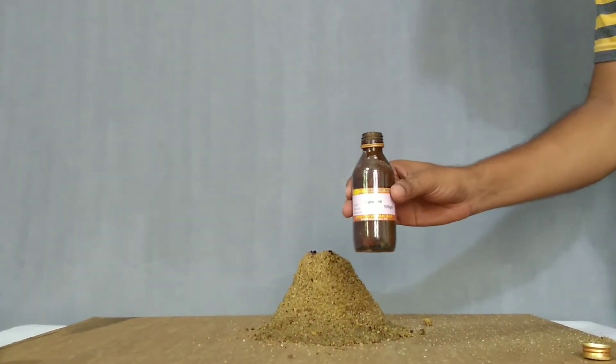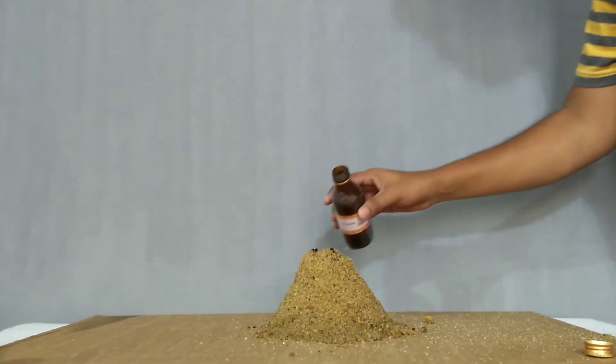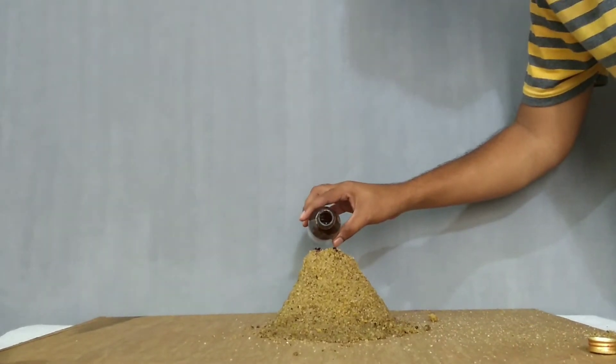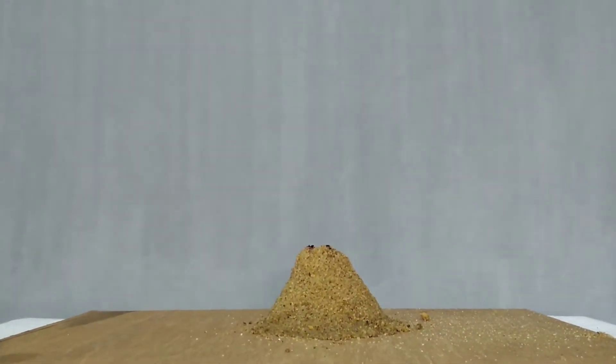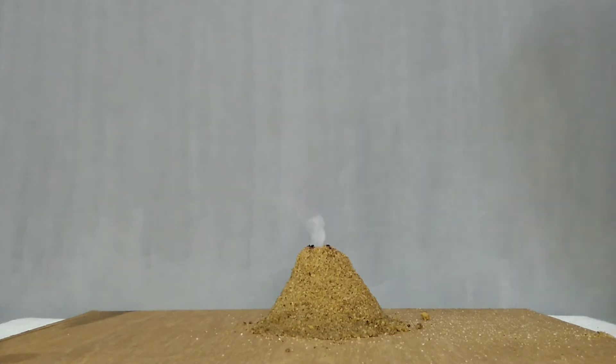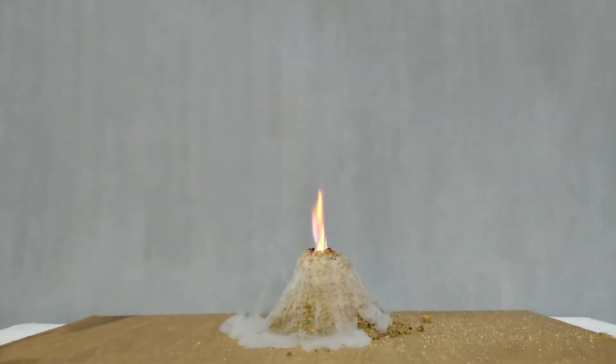Pour little glycerol over the pile of this potassium permanganate. Slowly pour the glycerol over the pile.